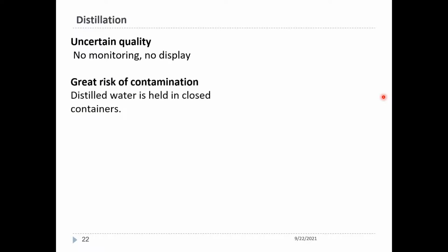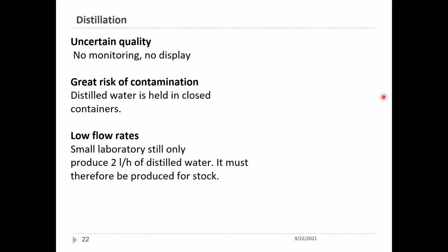Another disadvantage of the distillation is you are not sure of the quality. There's no display, there's no monitoring. So you distill water, you collect, you don't know the quality of the water. The water is held in closed containers.